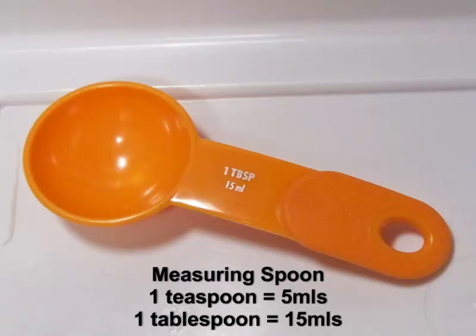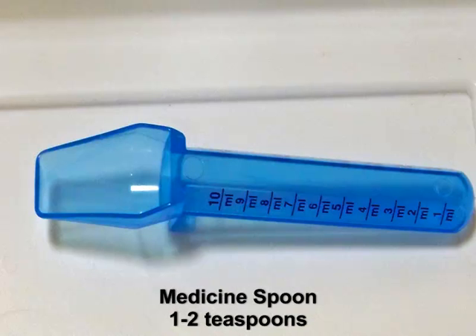A medicine spoon — most people have these as well, or you can pick them up at a drugstore — typically holds between one and two teaspoons. They also allow you to simply pour out the IJs onto your cups.